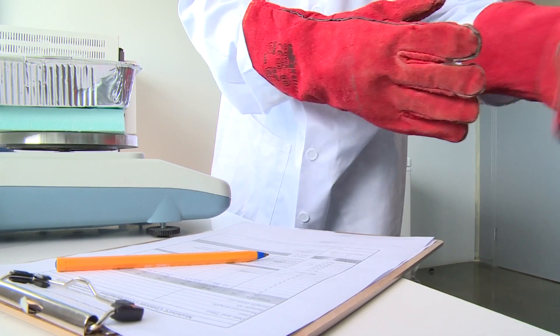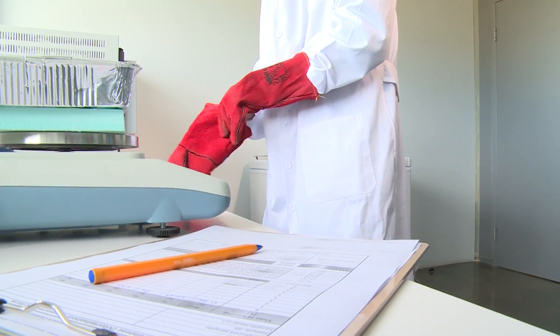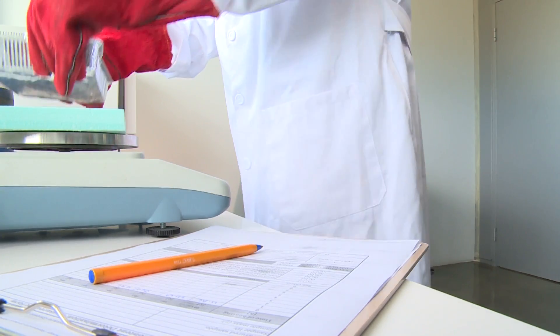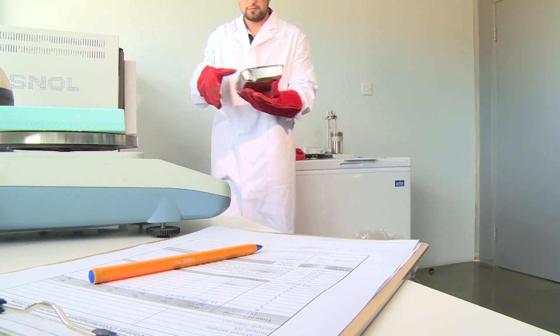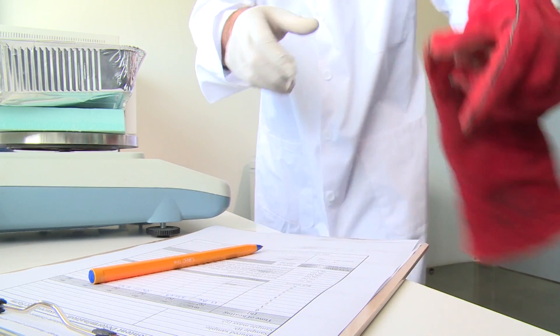Use heat insulating material on the balance pan to protect it from direct contact with the hot tray. Constancy in mass is defined as a change not exceeding 0.2 percent of the total loss in mass during a further period of heating at 105 degrees Celsius over a period of 60 minutes.